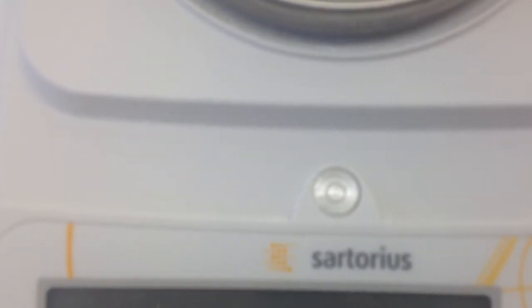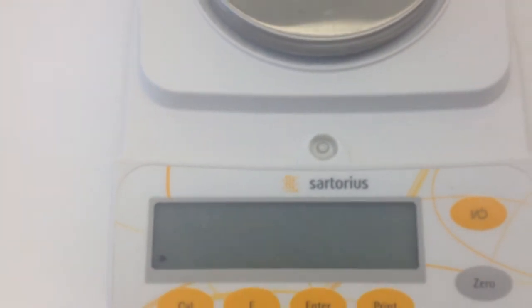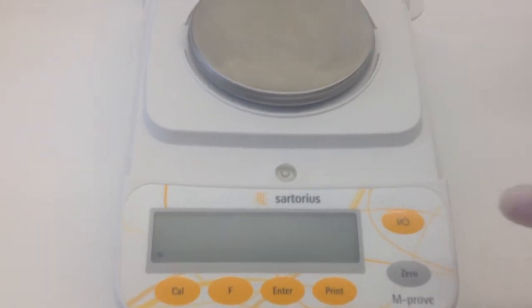So now that I've done that, you can actually see that the bubble is now in the center of the circle — we're level and we'd be ready to start. So I'll just pan back out for a minute. We can now turn on our balance.